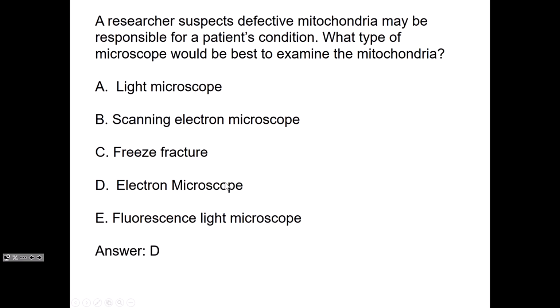Was there another question? Yes. For the scanning electron microscope, is it 360? It can be. You can rotate the stage that has the image in there. You take a picture and that's static, but then you can rotate the structure, whatever's been coded, and get a different view. So you can get pretty much a 360 view if you can rotate it all the way around. Other questions?